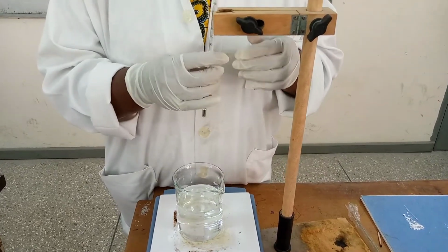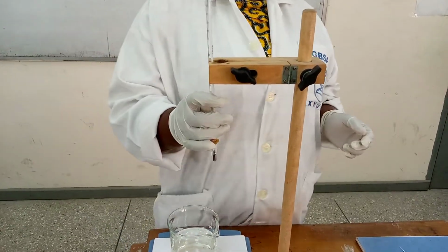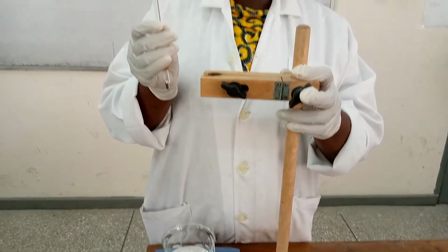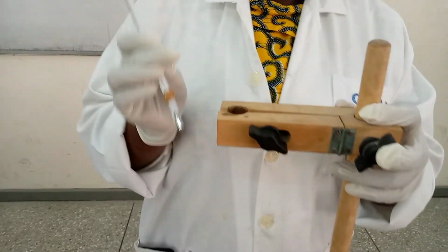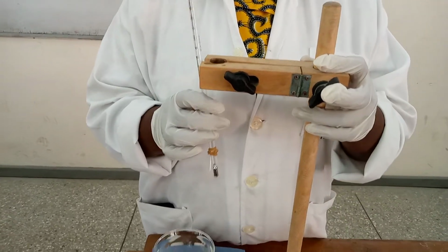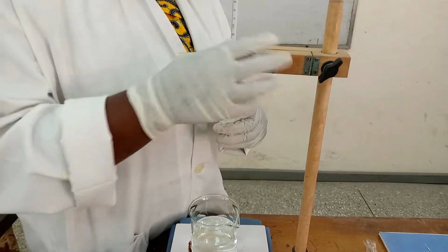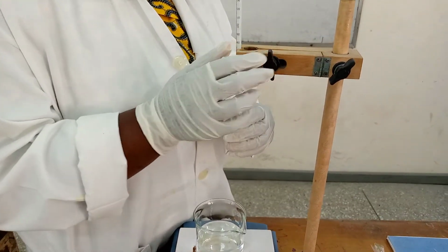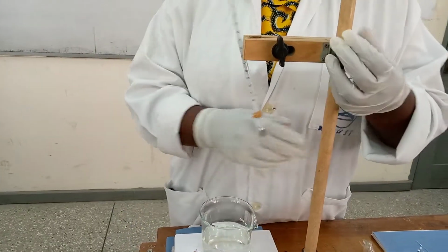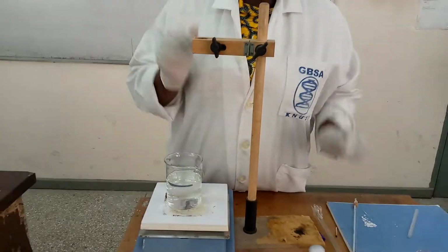So the tip here, they are going to clamp it at the tip here. Now there is a hole here, because the thermometer is very small. When I drop it in the hole, it will fall down. So just the tip, then I'll clamp it, yes, like this. Then I'll release this one. It's getting off, so let me do this way. Let me bring this one down.